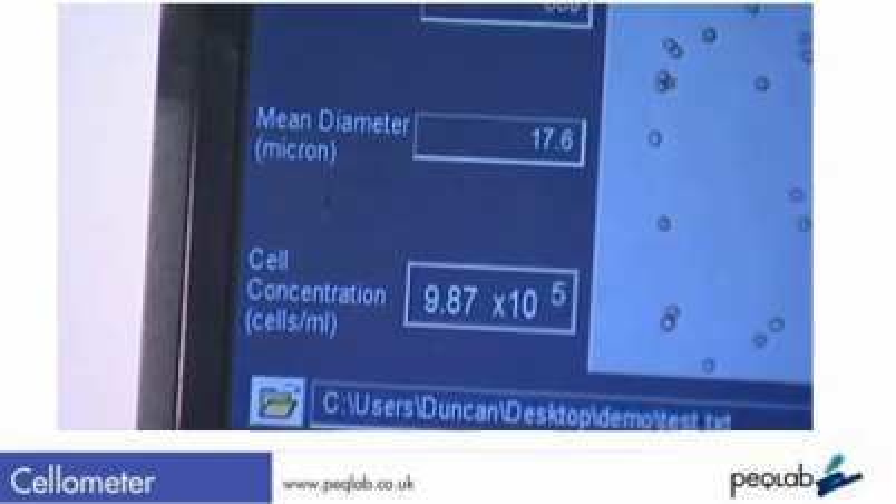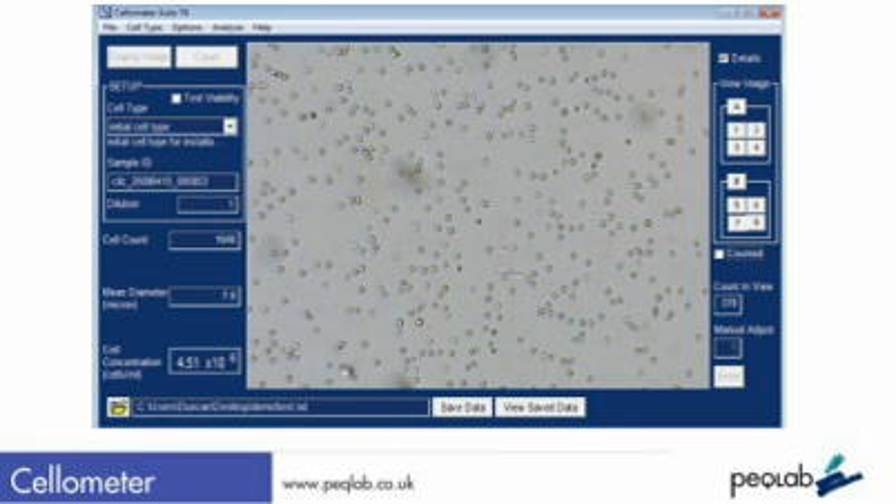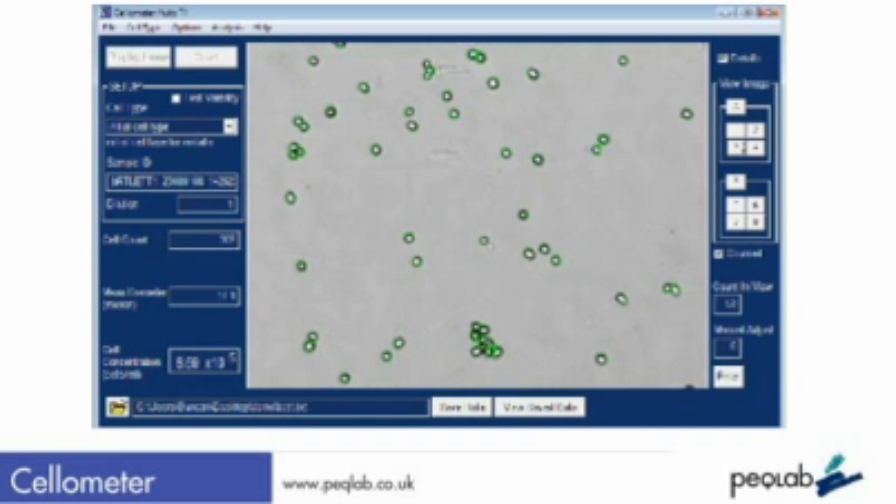On the screen, the results for cell count and concentration are displayed, plus the actual cells counted are circled to show you exactly what the system has done. This is very important for system validation, accuracy, or for building confidence in this automated platform.